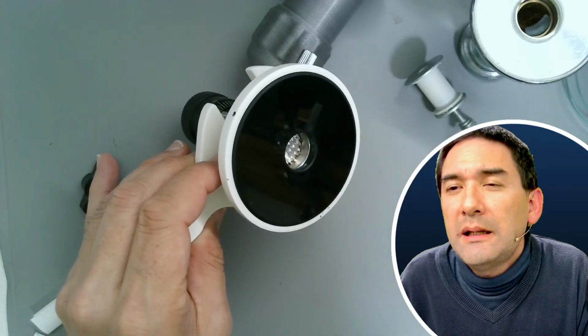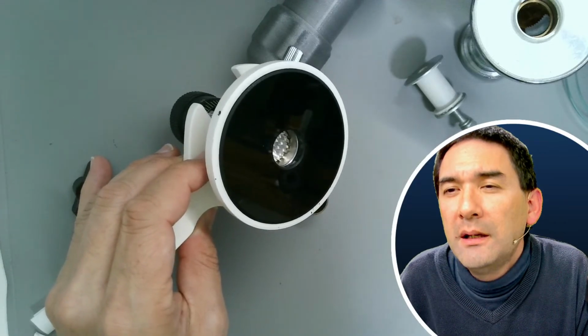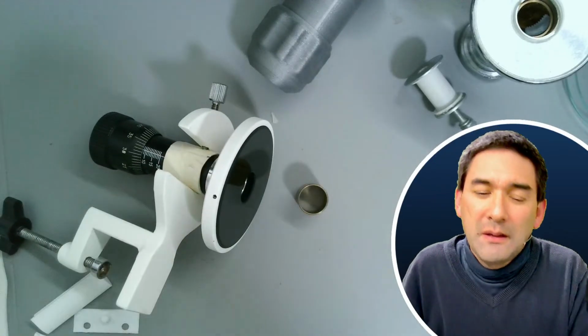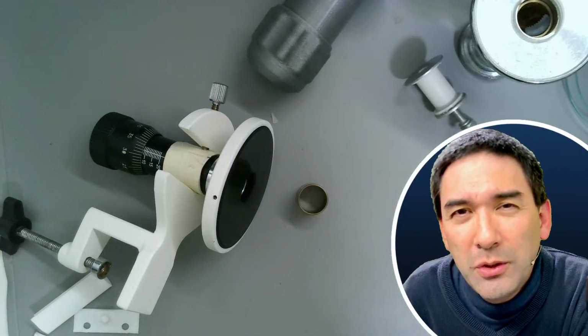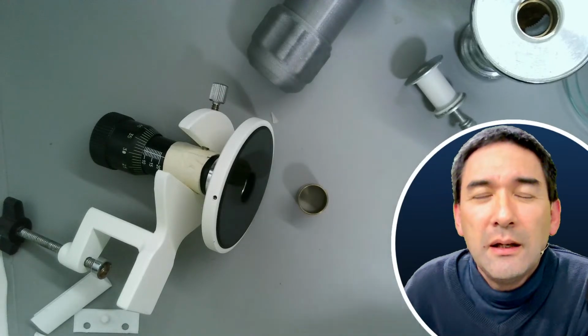Does that mean that I need to keep my objectives in a humidity chamber or something? It's rainy season here now, but do I need that? Well, honestly, the question again is with the humidity. How would you do that in a humidity chamber? I would say the following.